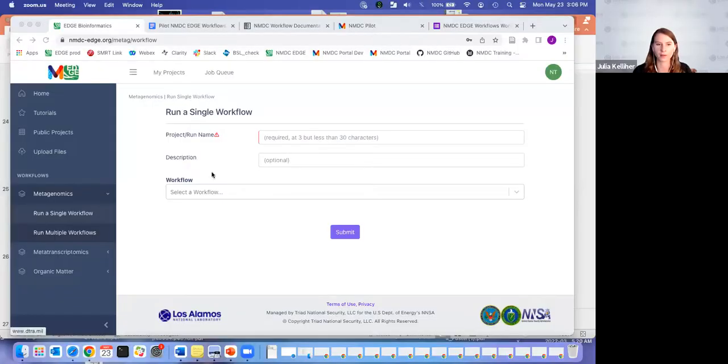Okay, great. And if you have already submitted something for the full pipeline, I also invite you to potentially put something through one of the run the individual workflows. We also have test data for the metatranscriptome and the natural organic matter if you're interested in those as well. I will give people another maybe 10 minutes to explore and potentially run some of the other individual workflows or explore some of the other options there. So I'll just give till 3:15, and in that time I will walk through running a couple of the individual workflows on my screen.